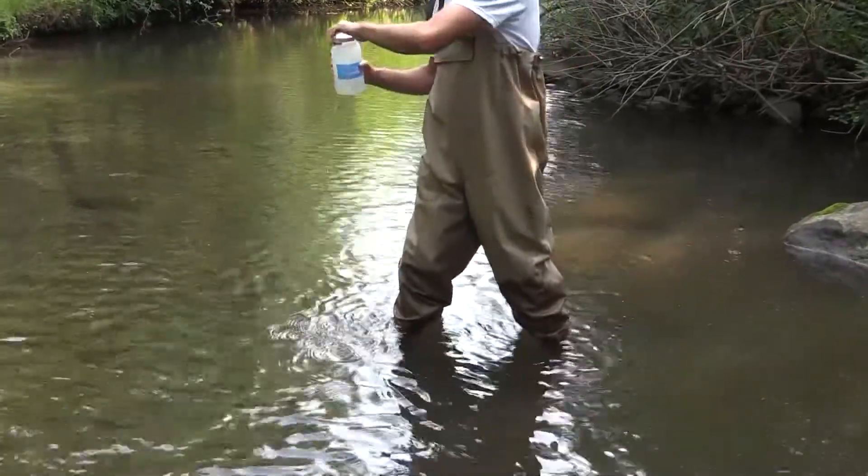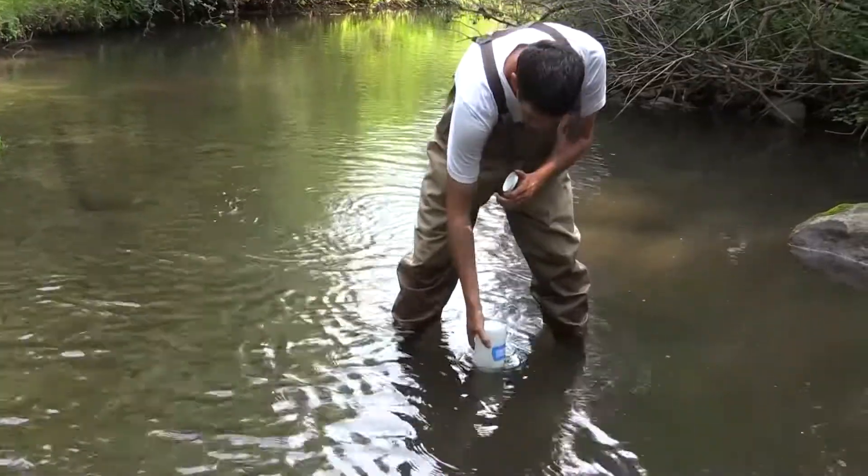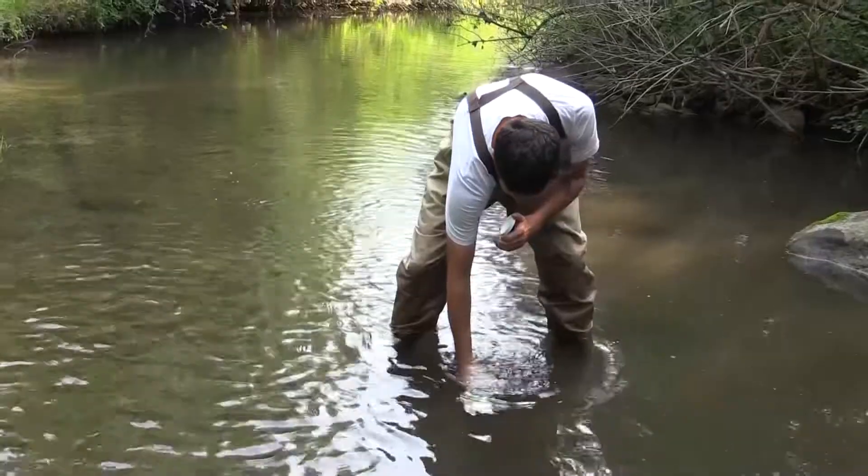When rinsing out the bottle, also rinse the cap and shake up for a few seconds. Ensure that following each rinse, you turn downstream to toss the water.